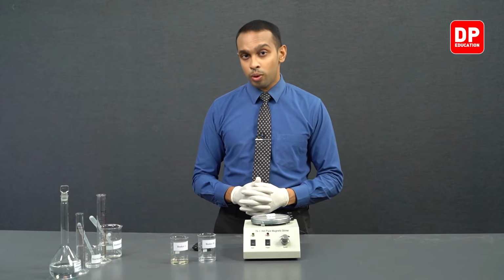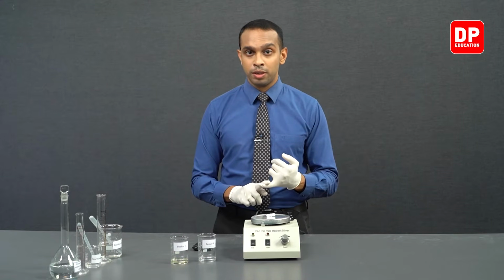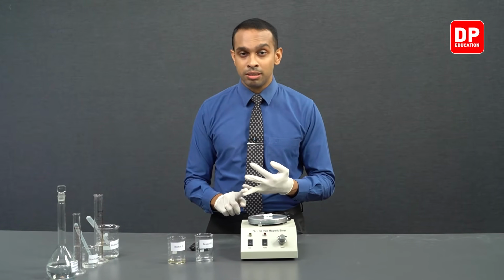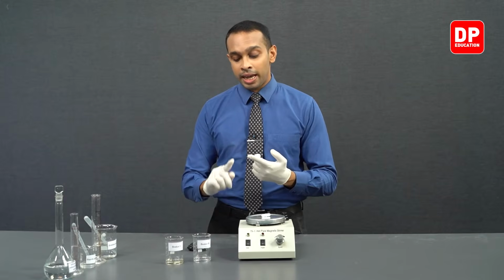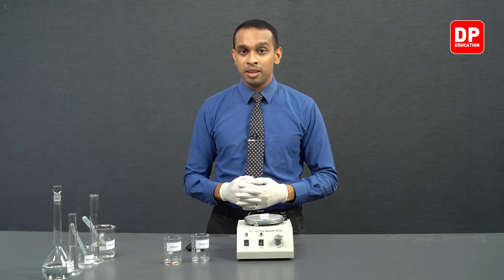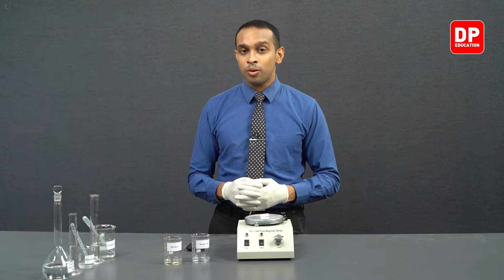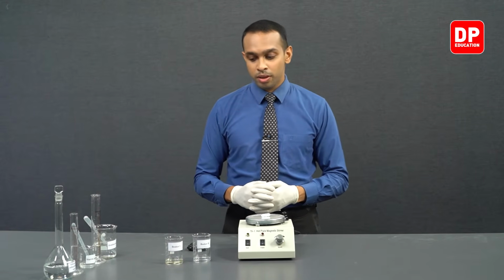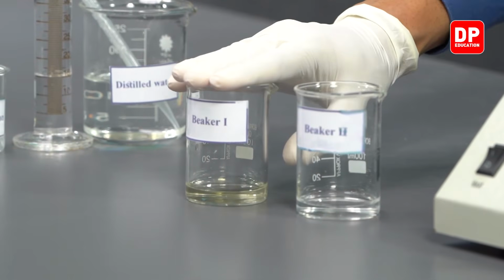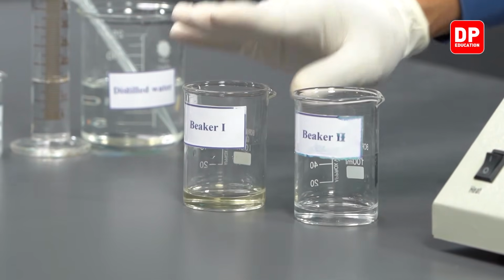In the first reaction we took 25 cubic centimeters of the Fe3 plus ion solution, in the second one we took only 20 milliliters, third we took 15, and now when it comes to the fourth reaction, we have taken 10 cubic centimeters of acidified Fe3 plus ion solution with the initial concentration of 0.1 moles per decimeter cube. So to this beaker 1, we have taken 10 cubic centimeters of Fe3 plus ion solution.